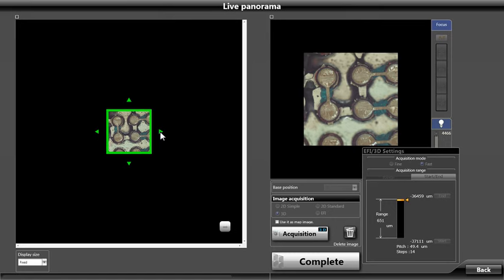The standard stitch option, which includes 3D or EFI stitching, requires there to be a percentage of overlap of the previous image, as the software will perform pattern alignment. This overlap is automatically set if we click the arrow. If we move the selection box manually, or move the manual stage, we will have to leave enough overlap area required by the software. We will simply click on the right arrow to move the stage.